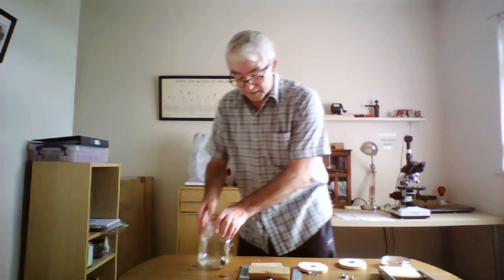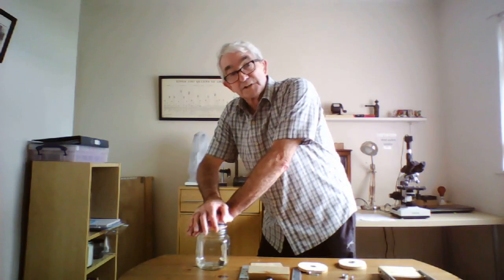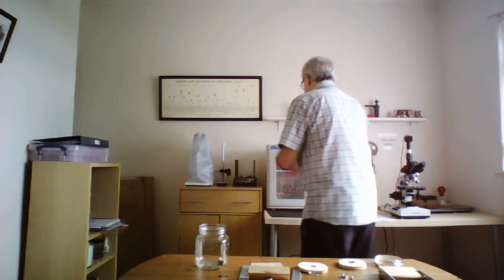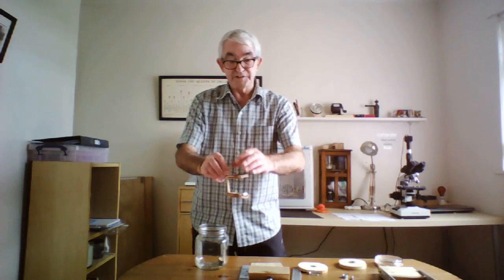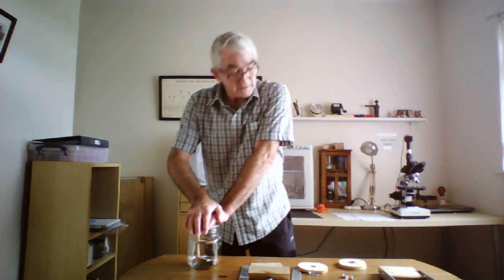Don't forget, when you first light it, always hold that down tight until the flame has gone out. I use the 55mm plates, just because of the size of my jar — you can't fit the 90mm in. I've also made a small carrier, which I put my petri dish on the top there, place in, then light, top on, then into your clamp.